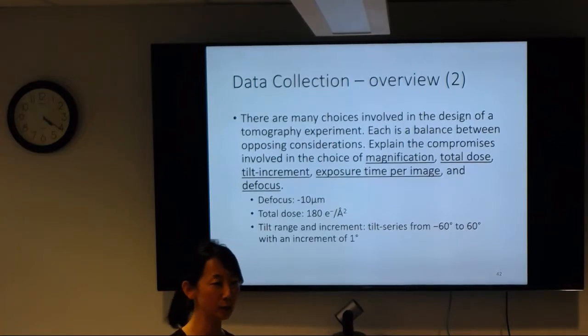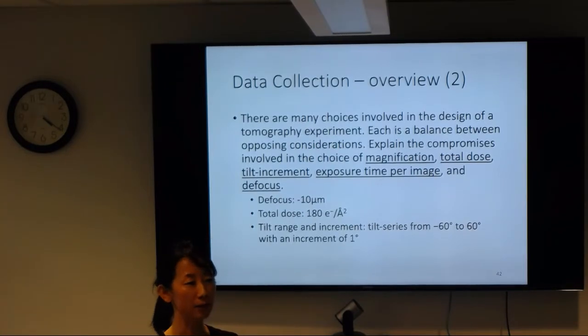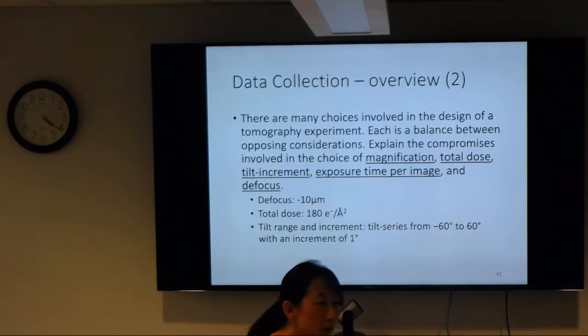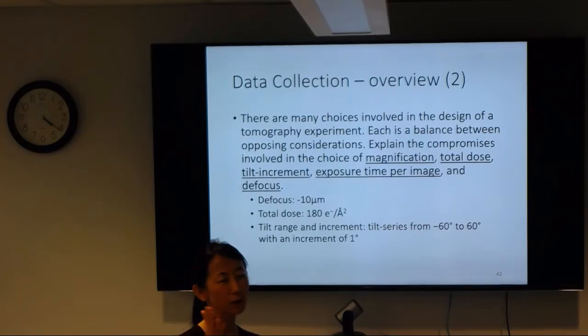But is it a good idea to just keep zooming in and apply very high mag? Is there any bad thing if we go very high mag? Dosing more of the sample, yeah, that's one consideration. What else? Missing wedge will be a consideration. The missing wedge will always be there. But if you go to higher magnification, you crop in more, so the view is going to be smaller.